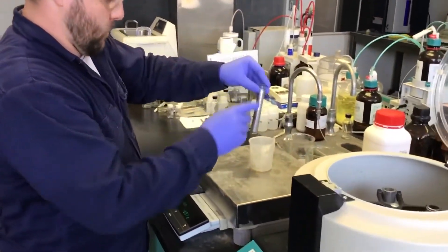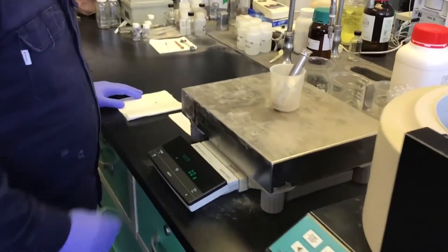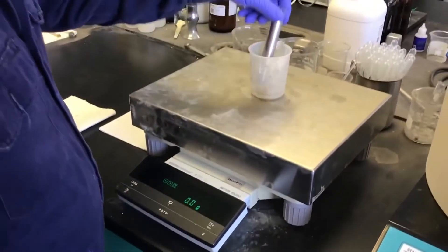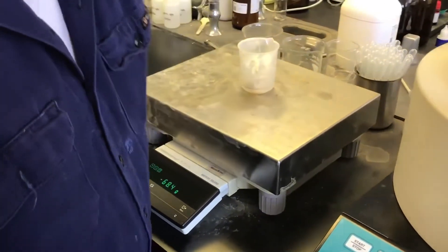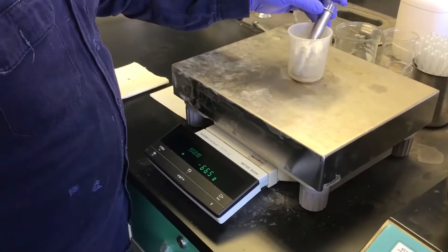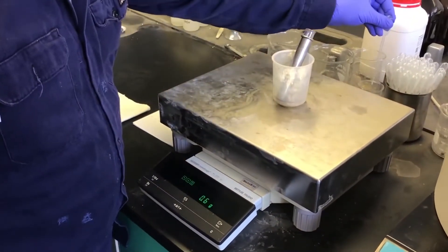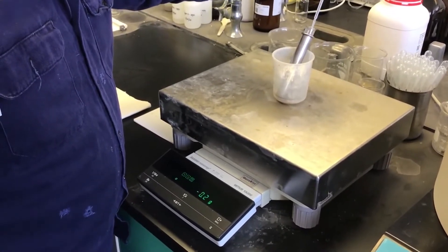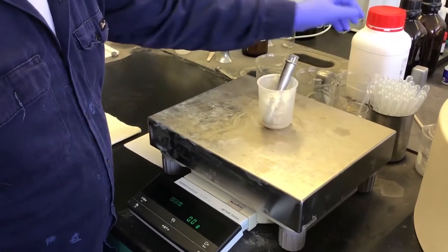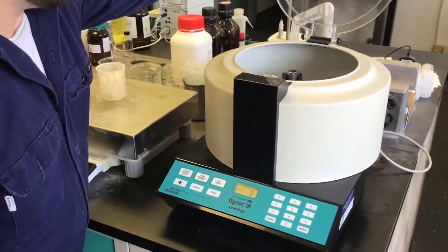To centrifuge, put your acid sample into the sample holder and place it on the analytical balance. Tear the weight on the balance, then take a centrifuge tube filled with water and place it on the opposite side of your sample. Add or remove water until those weights match — this will ensure that the centrifuge is properly balanced in its operation.